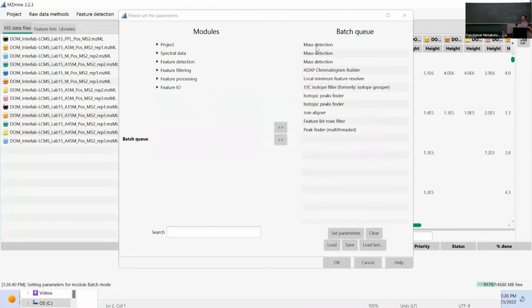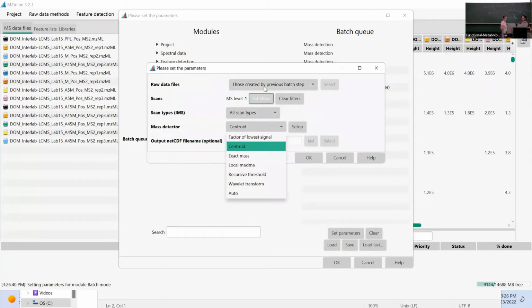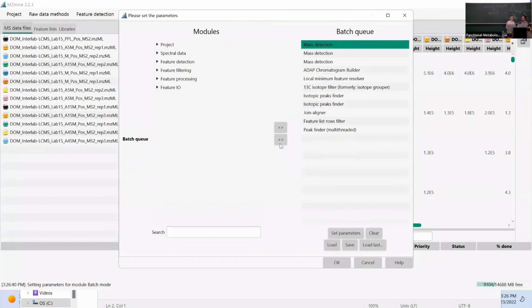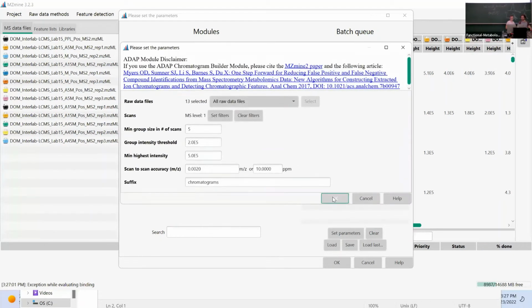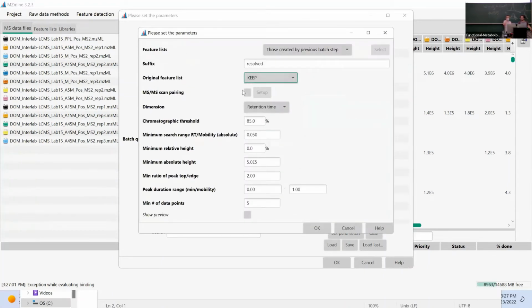All right. Okay. Okay. So all raw data files. Okay. So I hope you were better than I was.